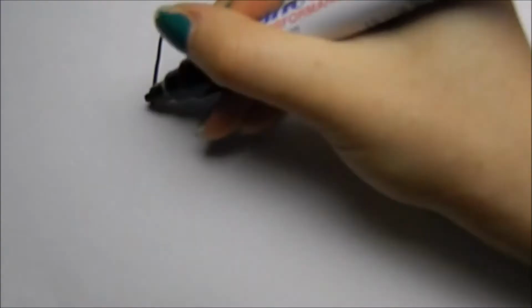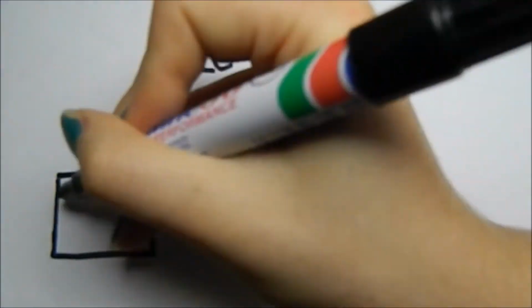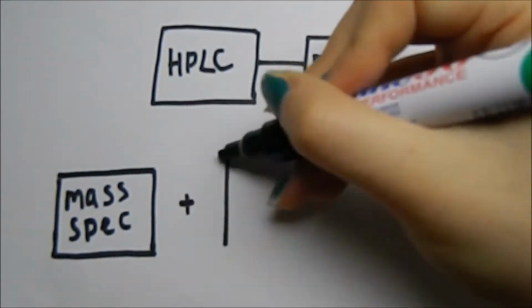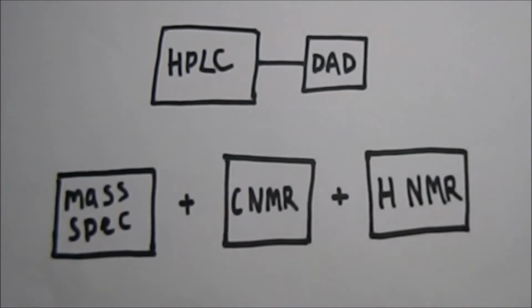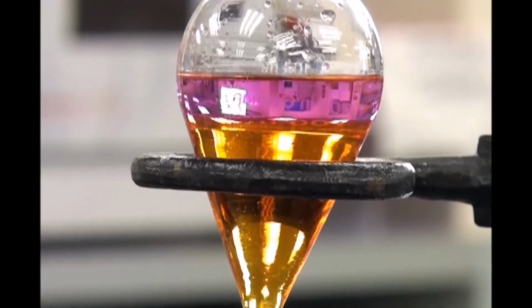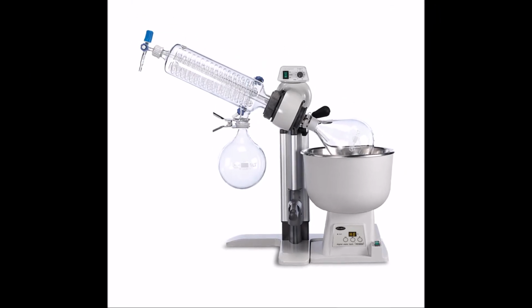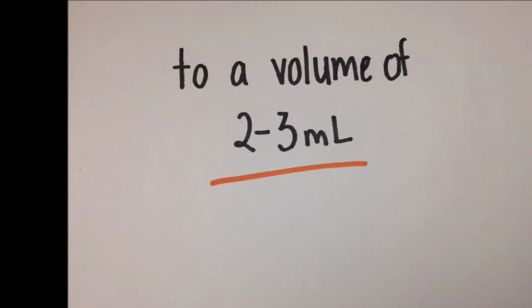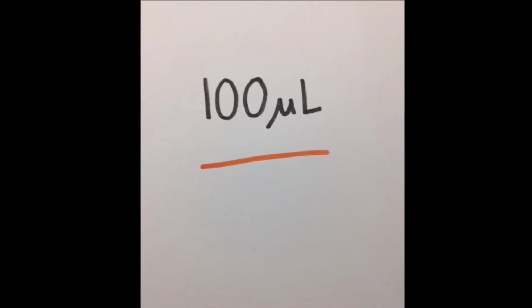Other analysis methods used apart from HPLC and DAD include mass spectrometry as well as carbon and hydrogen NMR spectroscopy to determine their purity and confirm their structures. After collection, the liquid samples are run through liquid-to-liquid extraction. The residual of this is then rotary evaporated, then dried with a flow of nitrogen gas. The resulting powders were then added to an aliquot of acetonitrile.